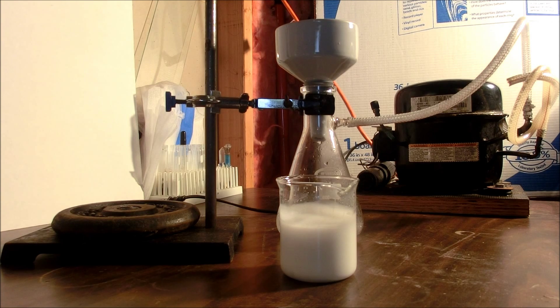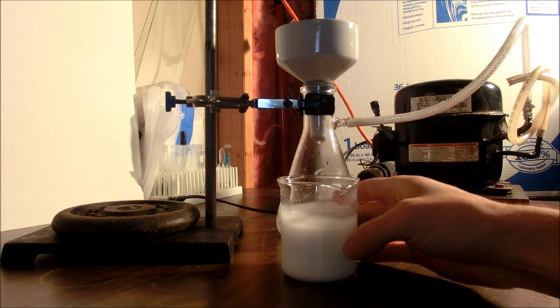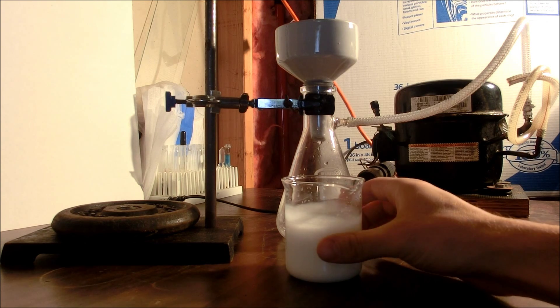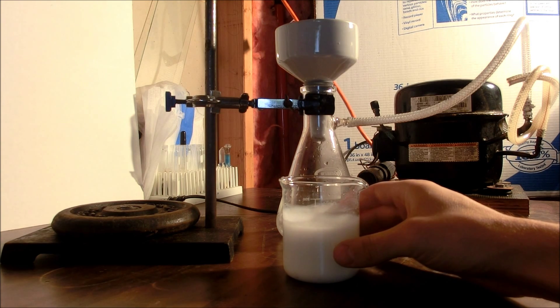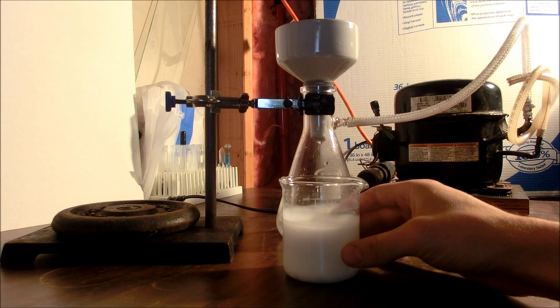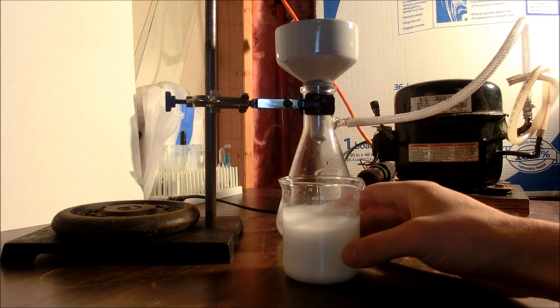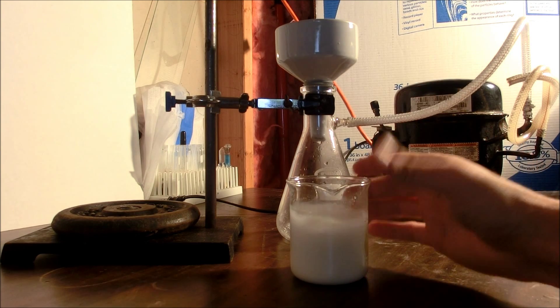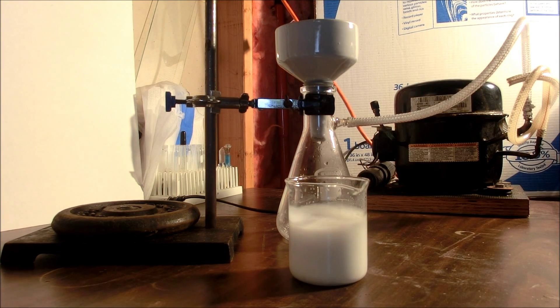After gas production has stopped, you can disassemble the apparatus and get ready for vacuum filtration. When you're filtering this, be very patient and slowly pour the solution onto the center of the filter paper. If you don't do this, it'll take you forever to filter this since this is such a fine suspension of zinc sulfide particles.